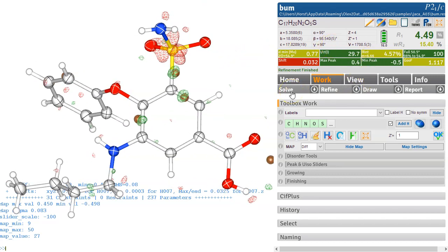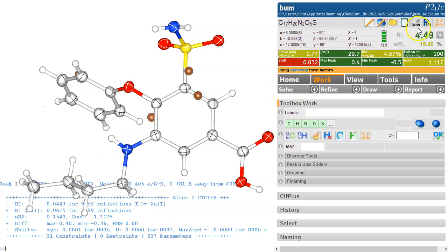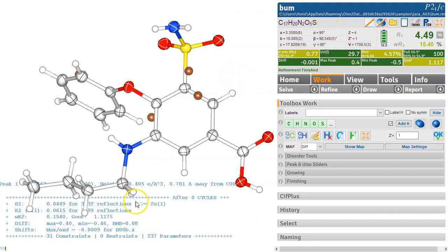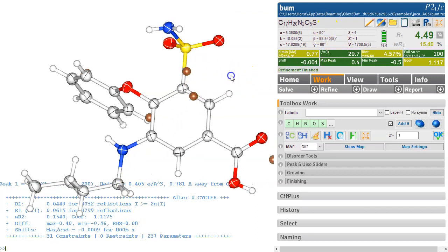So all we need to do to finish this is refine a few more times. And we can, of course, well, it's done, but we could type refine four cycles and, I don't know, let's do 12 cycles. And we want to see a number of peaks is fine. So let's just say we want to see five peaks, but we're already seeing that. And Olex2 refine stops when it's settled.